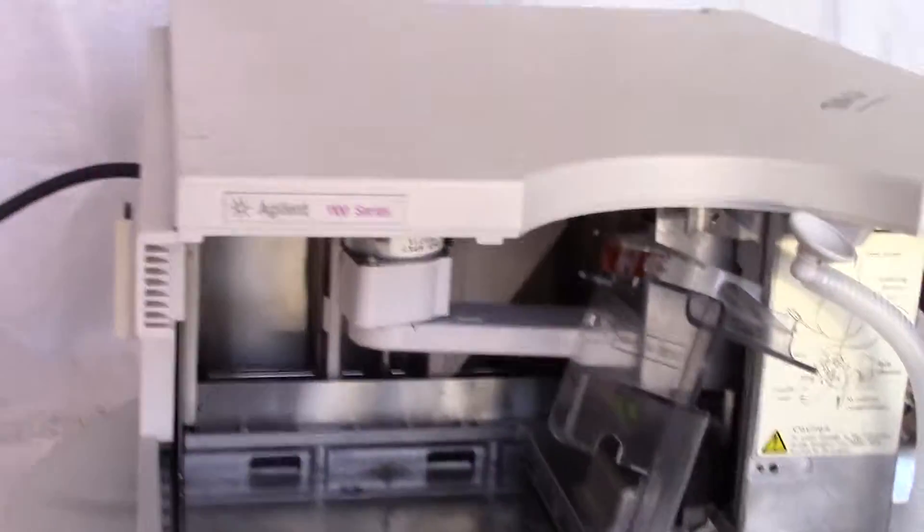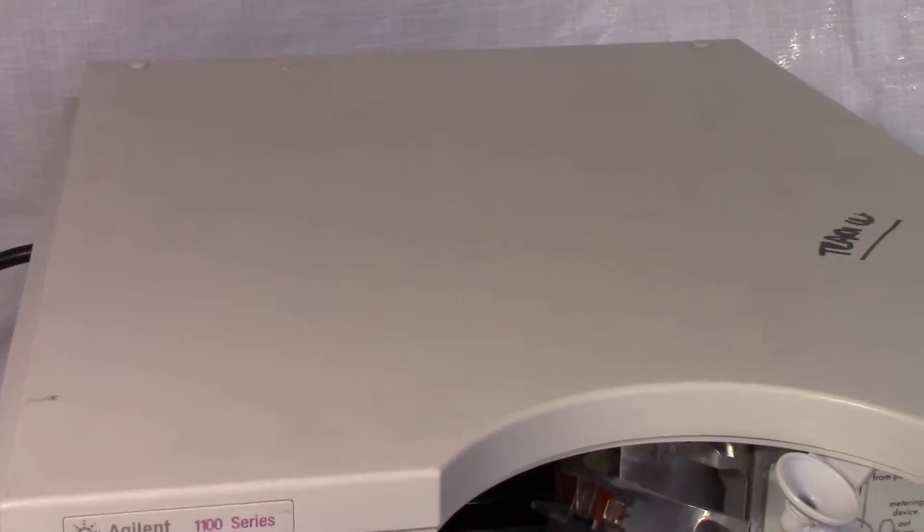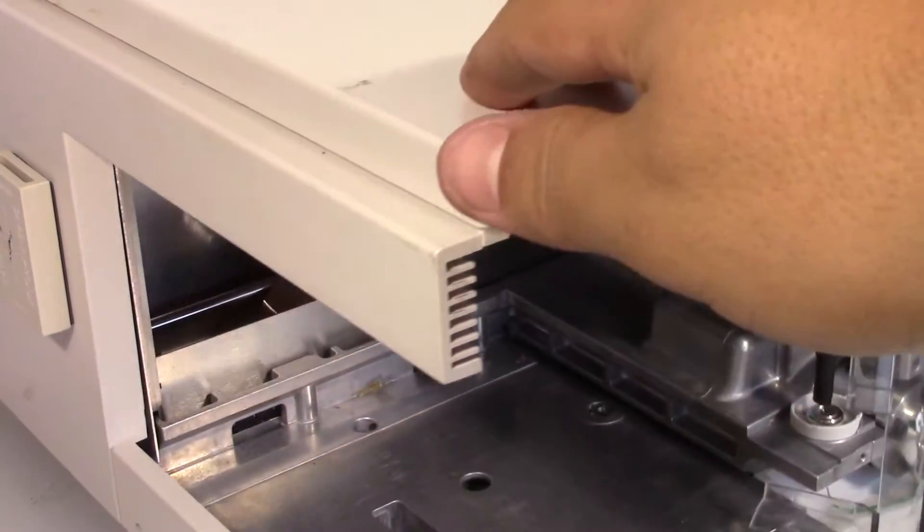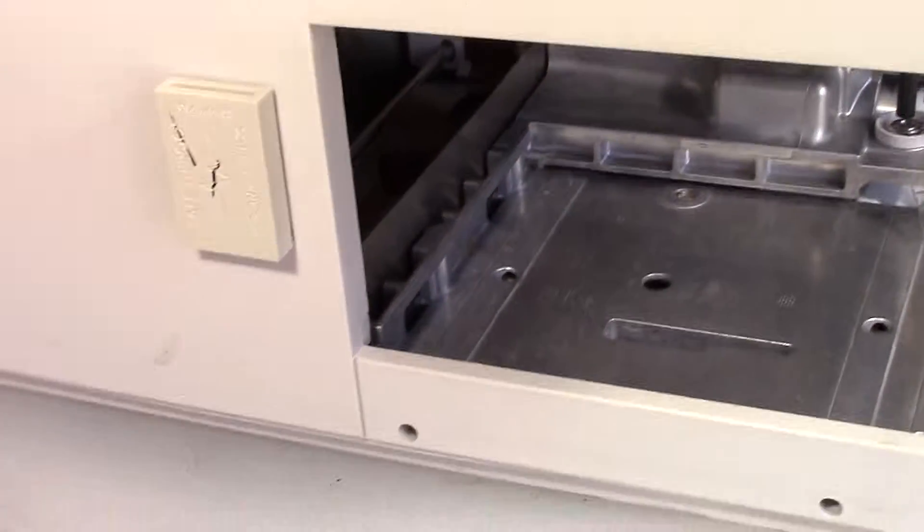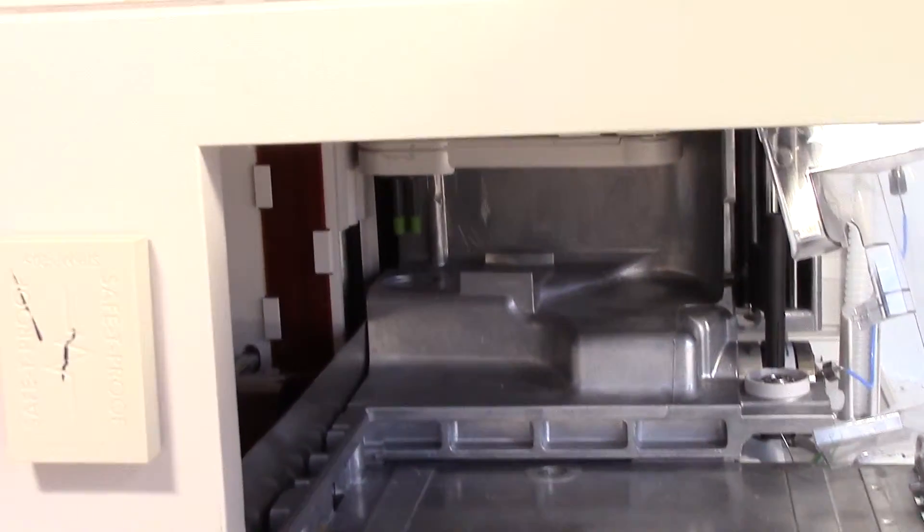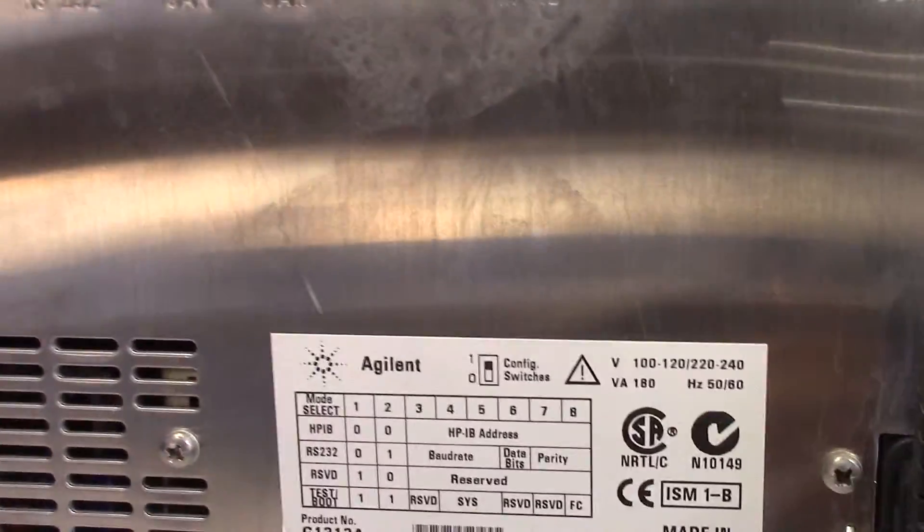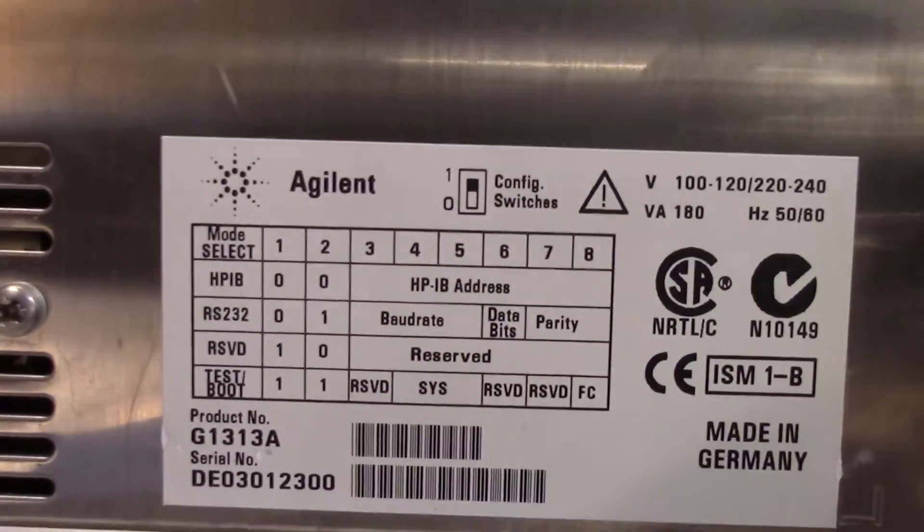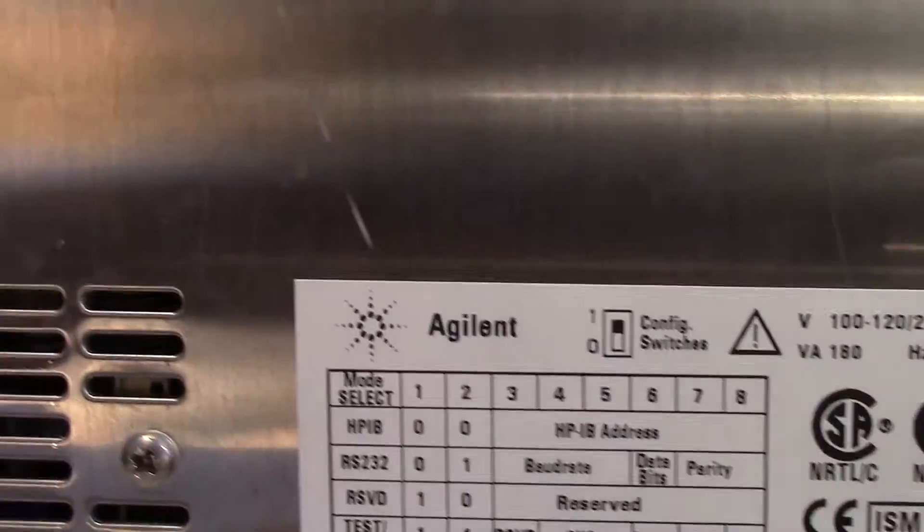There are scratches on the unit. There is the label. There is some writing on the top.